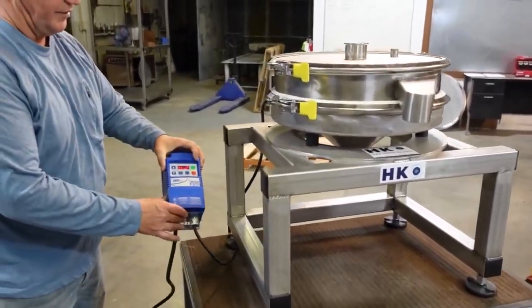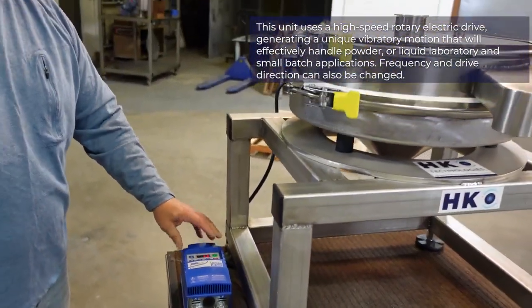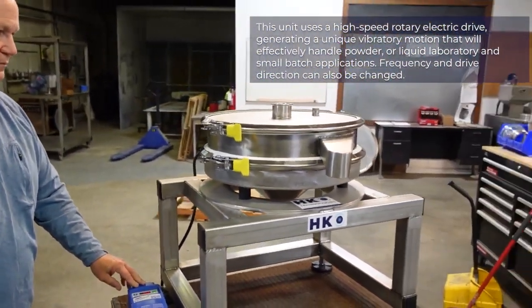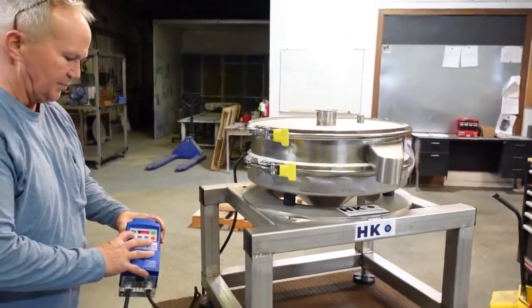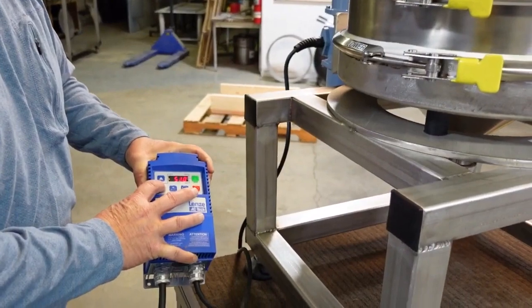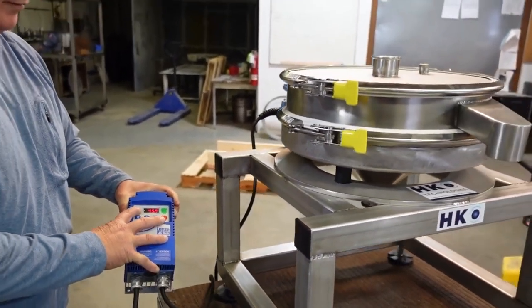The unit comes with a VFD. It allows the unit to run on 110-volt. This can be sped up or slowed down. You can also change the direction of the drive if needed.